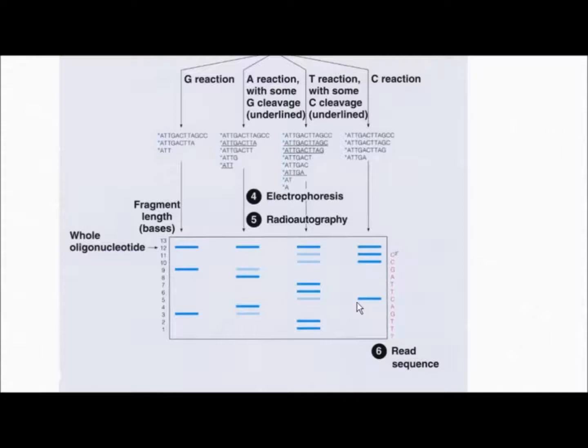Once you have these fragments and you can determine the masses of these fragments, because you know exactly what size is associated with that particular fragment and what it is composed of, based on these mass differences and how far the fragment is held on the stationary phase. And then this is obviously the slowest, the biggest one. And then you can reassemble. So think of it as a linear jigsaw puzzle that you're putting together.